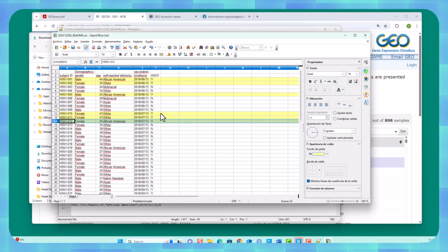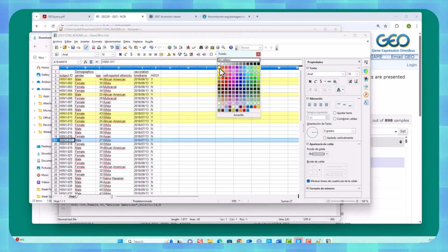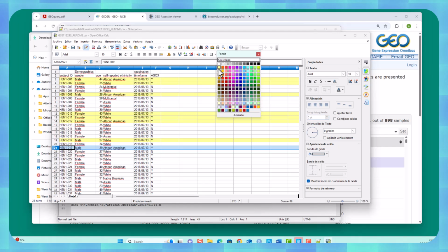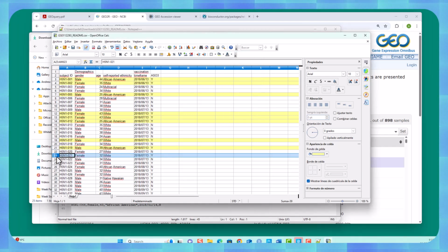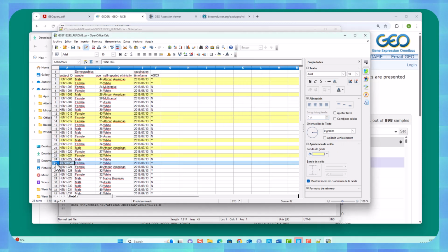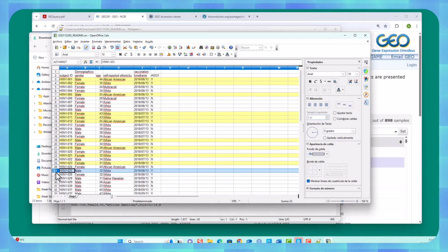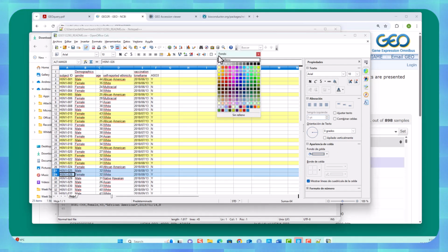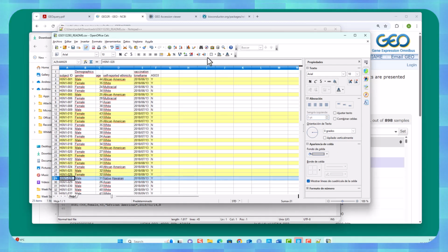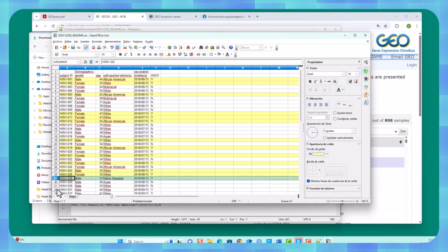Right, so have I missed any? It's kind of important to get it right because this is a phenomenally complicated data set. I'm going to save this as an Excel file or some other format once I've got this formatted so that I don't lose all the colouring again. So I can see. I could have done the 3 in a row. Idiot me. There's 2 in a row here.